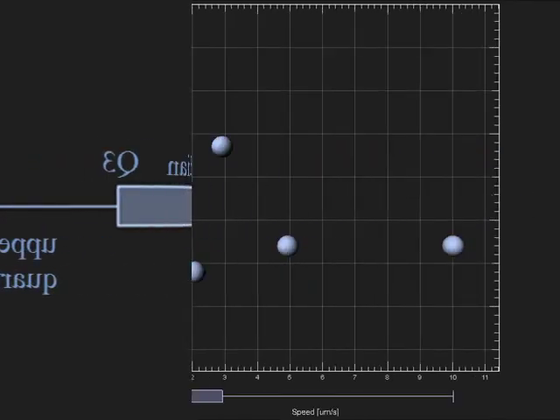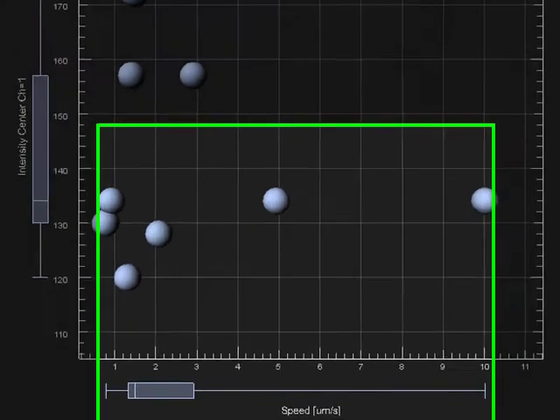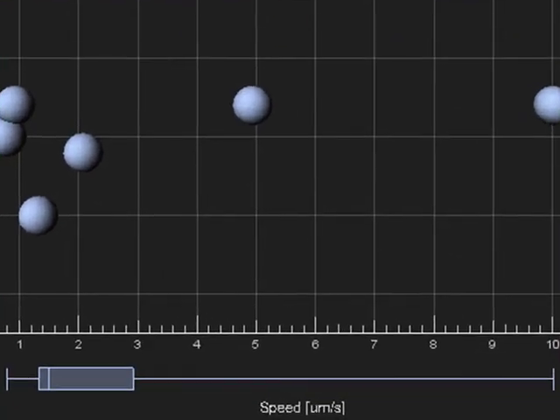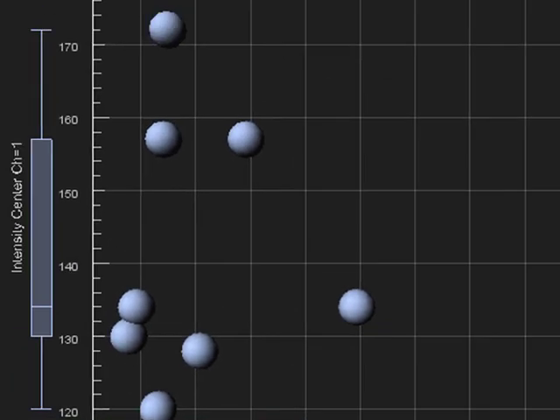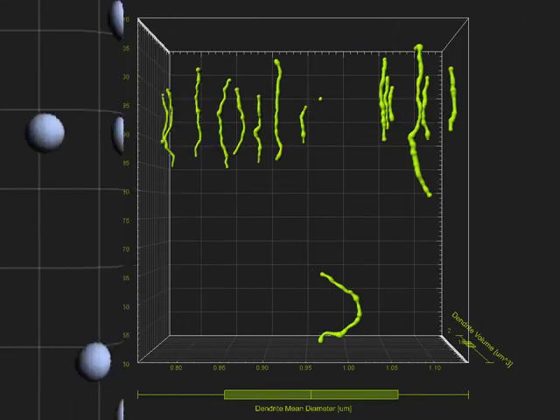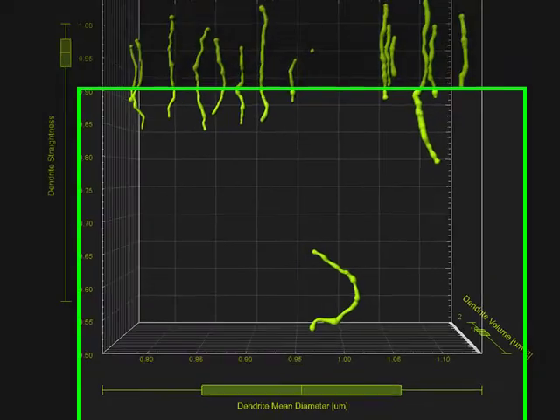The box plots are displayed alongside Vantage plots. A box plot shows the range, spread, and median value of the selected variable. The spread of all the data is visualized on a box plot by the distance between the smallest and largest value. The box plots can be drawn in all 3 plot dimensions for multiple variables. The smaller the box, the more consistent the data values are with the median of the data.